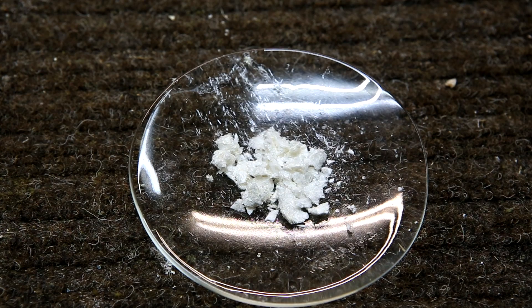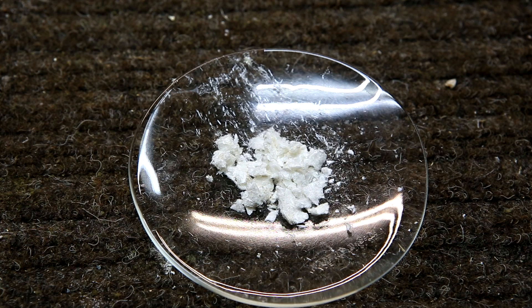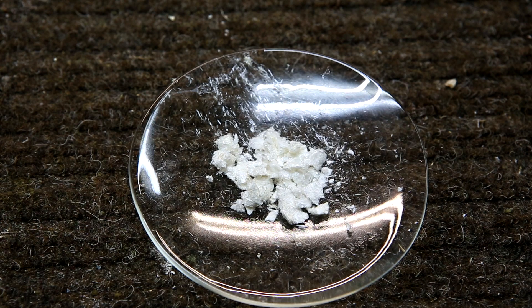However, I did buy the cheapest brand and it's possible that it simply didn't have much vanillin in it. I actually don't like this method too much and I'll be uploading a video shortly on how vanillin can be extracted from vanilla sugar using methanol instead of dichloromethane.